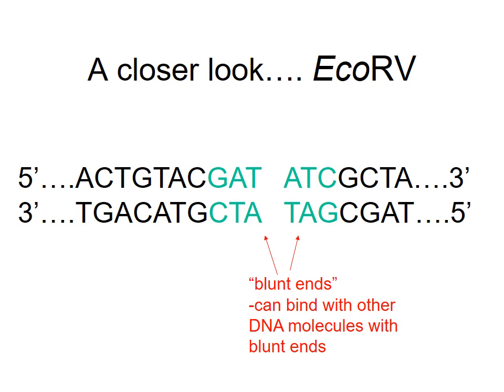So for example, the first segment or size of base pairs would be 1, 2, 3, 4, 5, 6, 7, 8, 9, 10. So this would be 10 base pairs. And the second segment would be 1, 2, 3, 4, 5, 6, 7. 7 base pairs. All right.